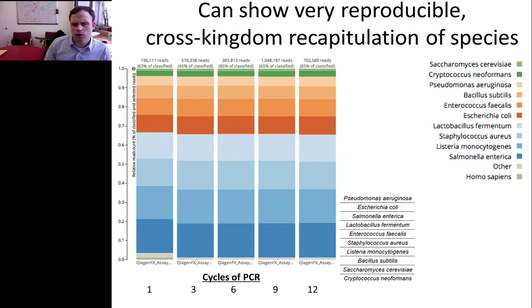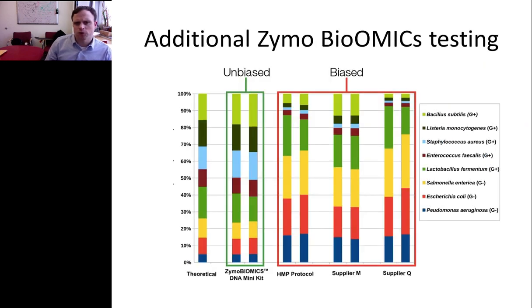And so we can see here that PCR was not our big variable. We do know, again, we can see these species pop up, but we know that also different protocols, and this came up a little bit from work that Dr. Tang has done, is that different protocols we know will give different yields of what should be theoretical output from some of these organisms.